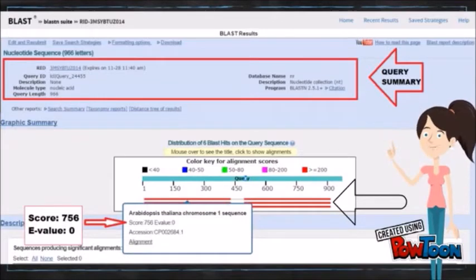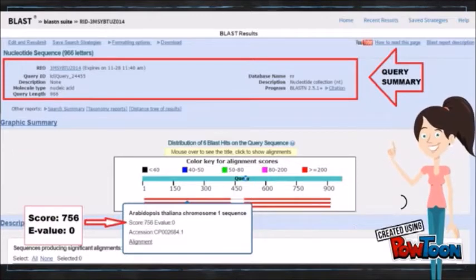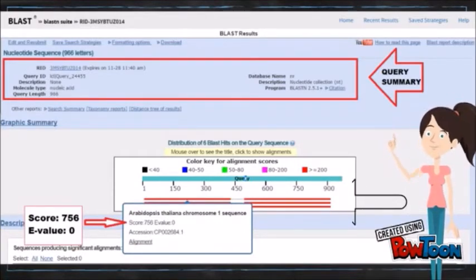Plus, here you can see the top segment displaying the color key in the query base scale. The colored bars represent the actual HSPs. Highest scoring segment pair, HSP, is the fundamental unit of BLAST algorithm output. The position of each bar indicates the region of the query that HSP covers. And the thin line indicates that the two HSPs are from the same sequence.